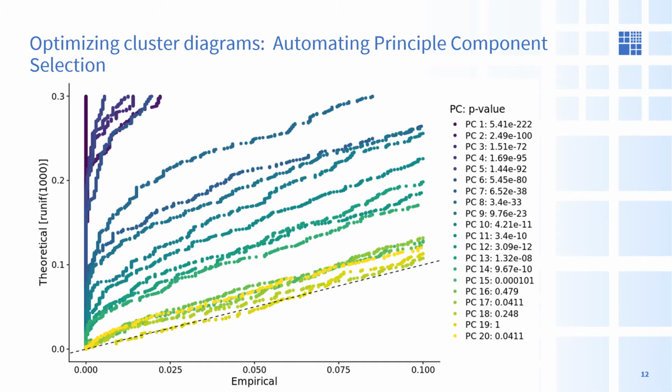Usually it's an educated guessing game where some bioinformaticians will start off with 10, some will start off with 25 principal components depending on the dataset, and then by trial and error that number of components is adjusted. What we've done at BISC is automate this process so that, building off of the jackstraw plot function, we choose only principal components that can account for a certain percentage of the variance seen in the dataset and are significant, saving a lot of time and providing a statistical reasoning for why we've chosen certain components.